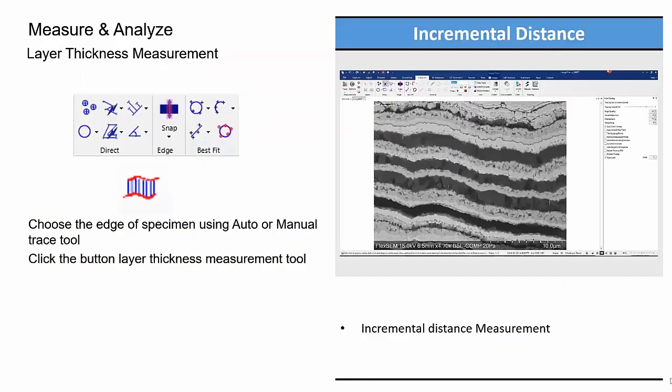Just giving another example of some of the tools available for manual measurements. As you can see, there's a range of manual measurements direct. We can do all-max snap to edges. But in this example, coating thicknesses, layer coatings. This is a coated material, but it could be thermal spray coating, or coatings on, for example, a stent. We do work with paint manufacturers, different coatings where they're taking cross sections and looking at different layer thicknesses.